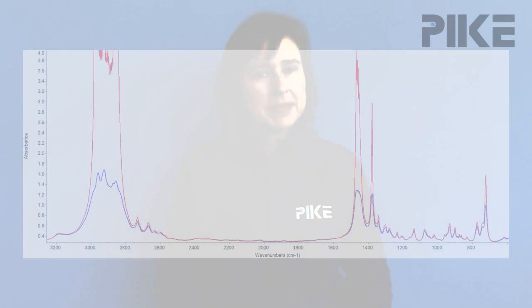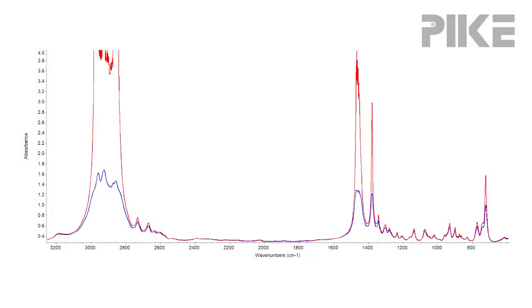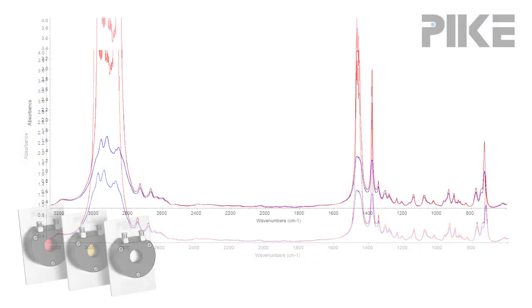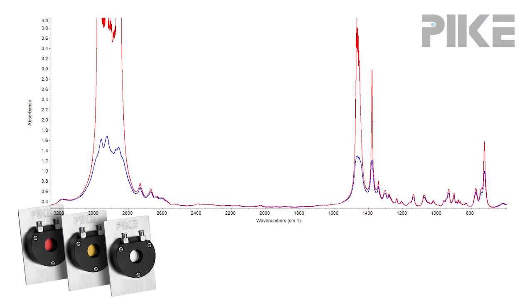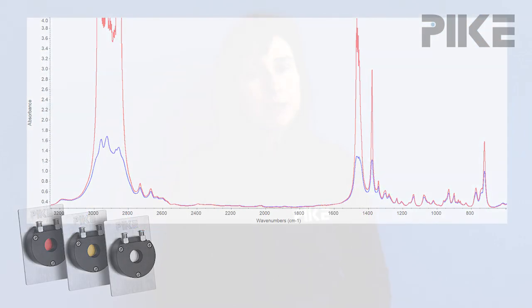Hello and welcome. Let's start right off by looking at some spectra I collected this morning. The sample was heptane. I used the Pike SmartSeal Liquid Transmission Cell with a path length of 0.1 millimeter and zinc selenide wedge windows.